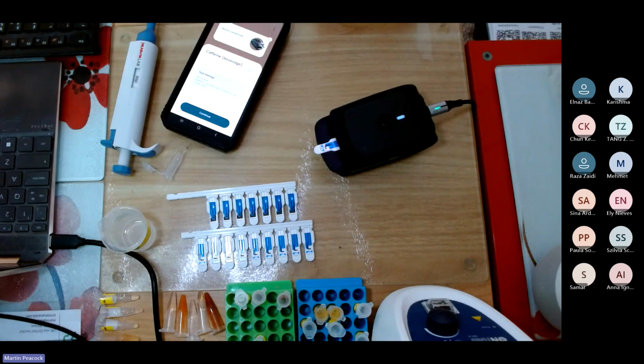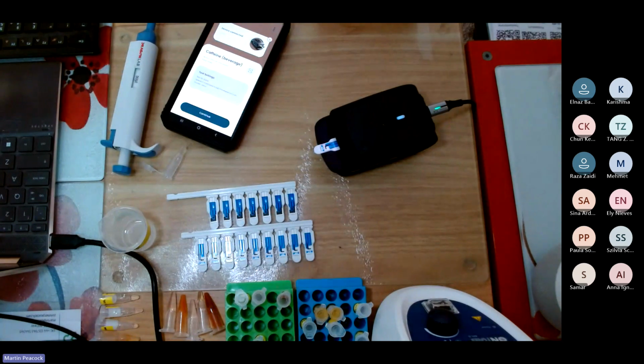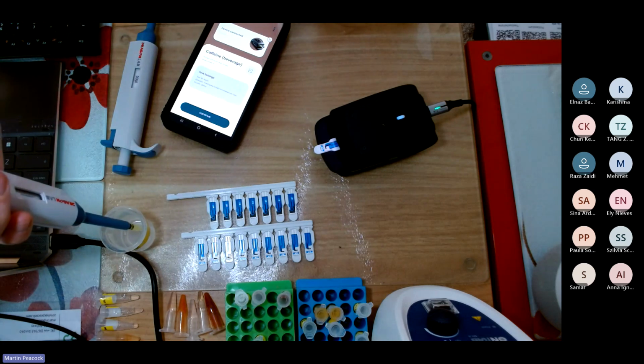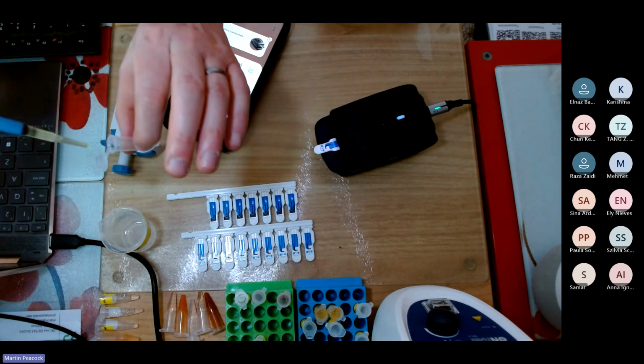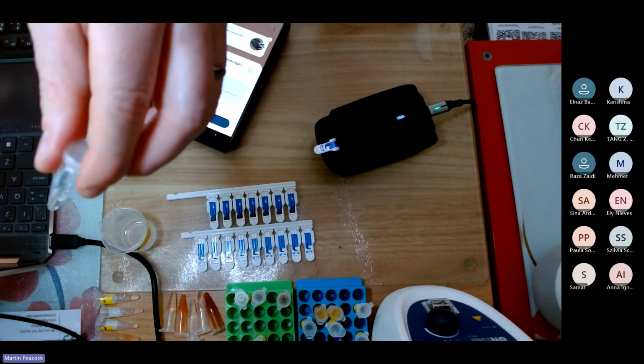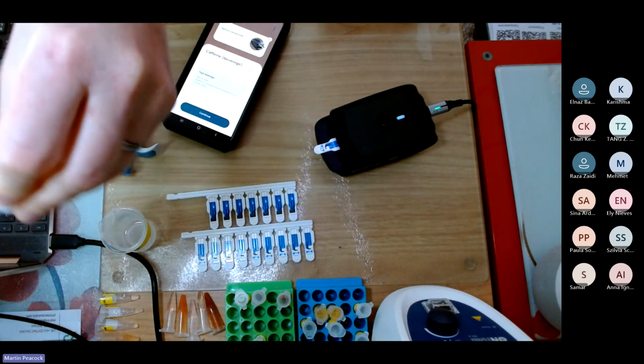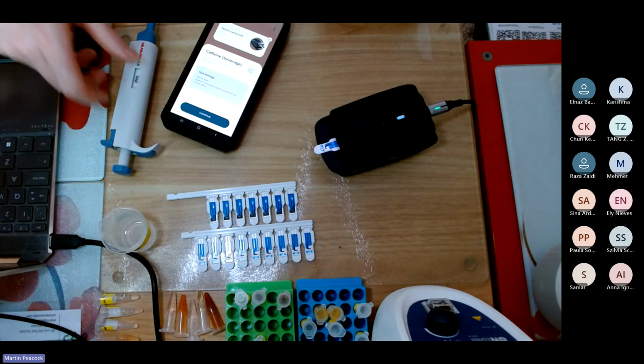I've grabbed 1 volume of the carbonated drink, which has got caffeine in it, it's Red Bull. Let me grab 1 volume of buffer, because most of you have a strong background in electrochemistry. You can understand that carbonated drinks don't have a lot of electrolytes in them, so we do have to add those electrolytes. Now let me show you the next power of electrochemistry. All right, so I've put those 2 volumes together. Let me do the sample prep. Done. Right, now let's take 50 microliters.